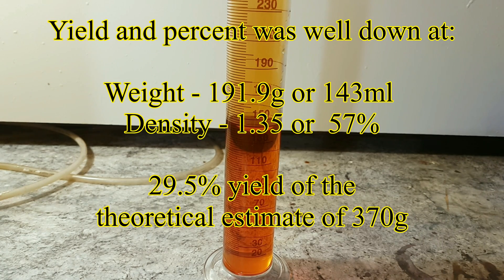I ended up getting a weight of 191.9 grams, with a density of 1.35 grams per millilitre, which made it around 57%. The theoretical yield estimate was going to be about 370 grams, so that equals to a 29.5% yield.